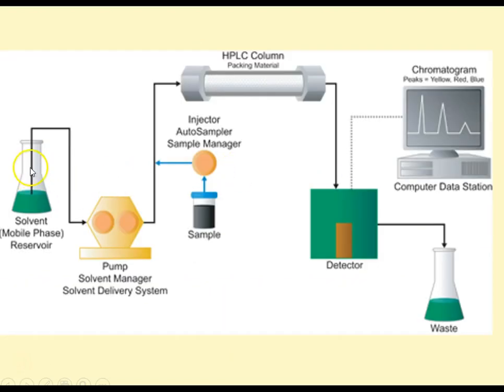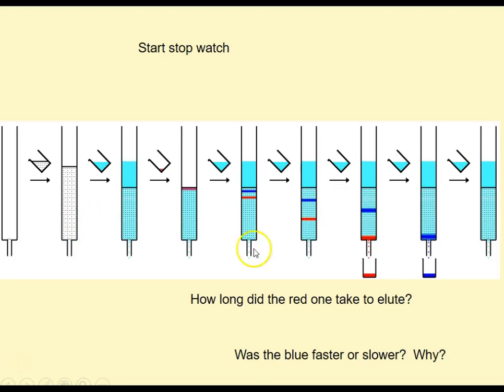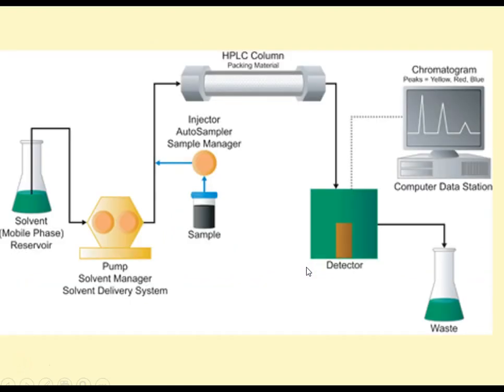Okay, so that's all very fine if the little particles in here are quite large and the water or whatever it is can just be dragged through by gravity. But we're looking at HPLC and the particles in here are tiny, and the water or whatever the solvent is will never move through just with gravity. So we actually have to put it under pressure and push it through.